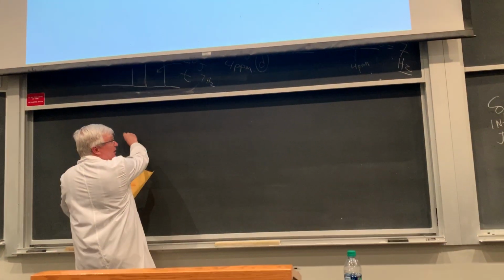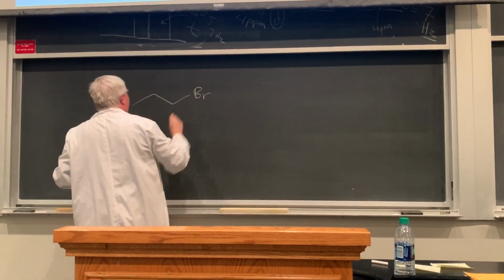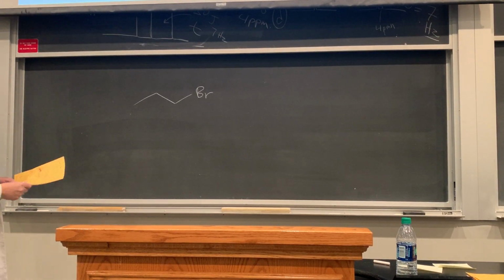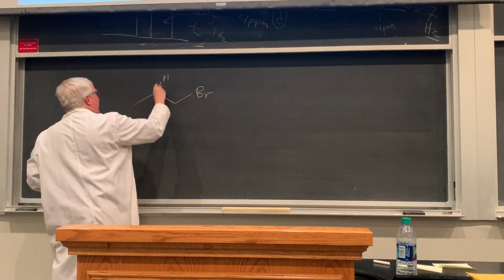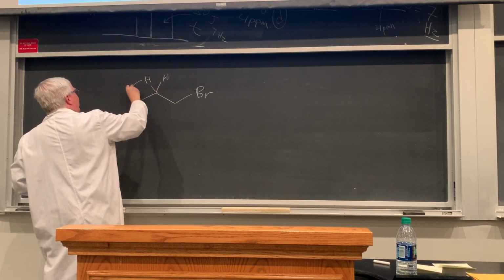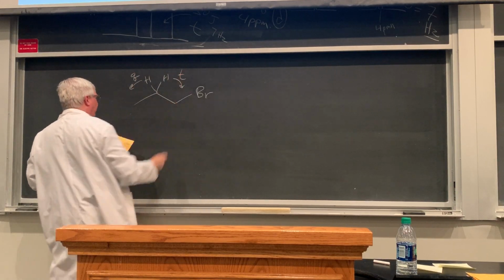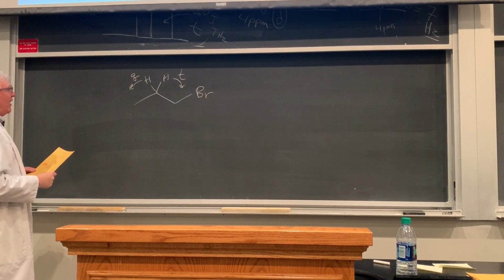I want to look at that pattern there and see this n plus 1 times n plus 1 if we have a complex splitting pattern. So these two right here are split as a quartet this way, and this way over here is a triplet. Now, you can do this different ways to analyze this, okay?